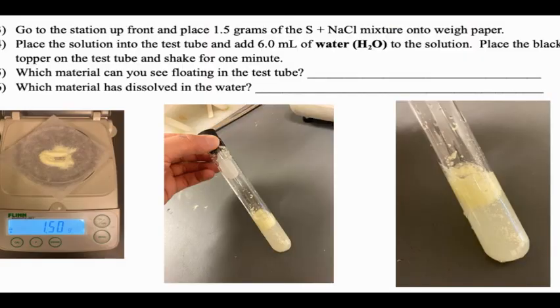Next, we will be adding this sulfur and salt compound to a mixture by adding water. So we go to our lab station up front and we measure out 1.5 grams of the sulfur and salt mixture onto weigh paper. Next, we place that solution into a test tube and add 6 milliliters of water, H2O, to the solution. We place the black topper on the test tube and shake for 1 minute.